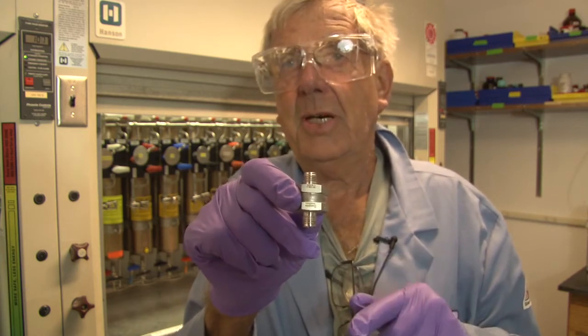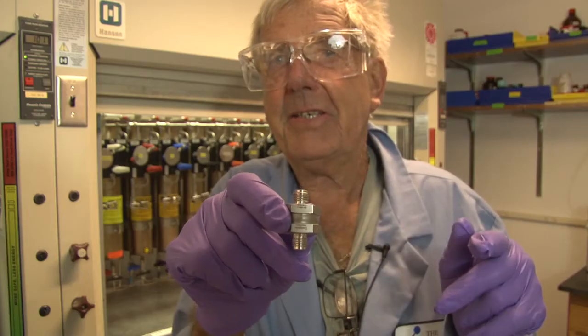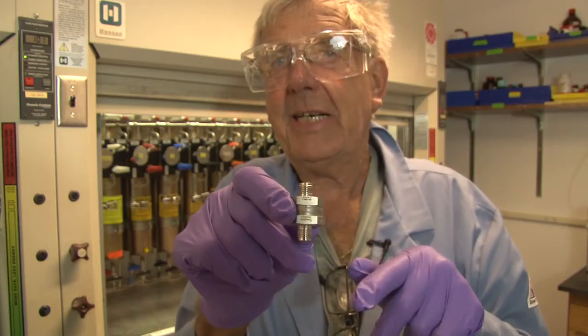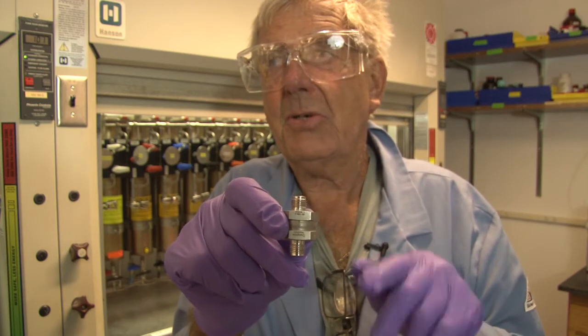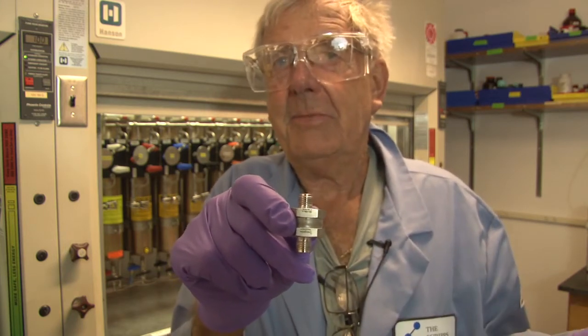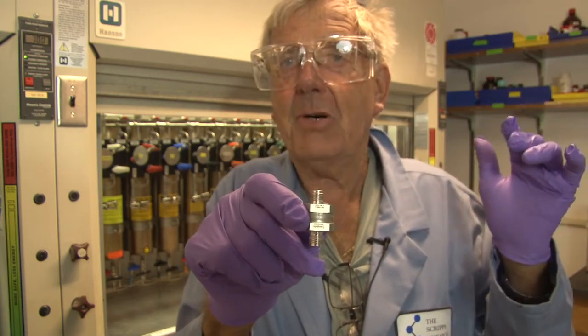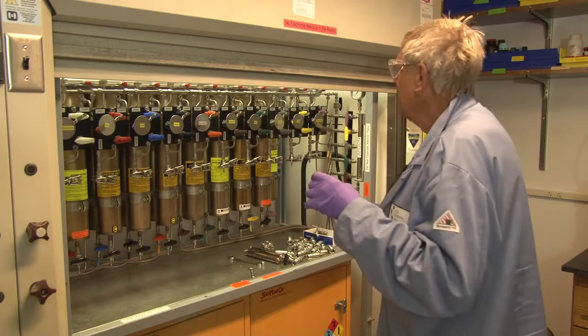Do not operate a cell phone while taking off solvents because you think you have the time — because nobody cleaned the filter and the flow is really slow. You walk away, have a sandwich, go to lunch, and you empty everything through the pump onto the floor or against the wall.